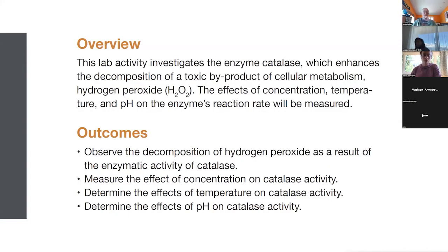So the enzyme we're going to be using today is one we used in a previous experiment. Remember, we used yeast in another experiment with hydrogen peroxide, and the yeast has an enzyme in its surface called catalase. I mentioned at the time that it was one of the first enzymes that was discovered, and that's why it got the name catalase, because it catalyzes a reaction.